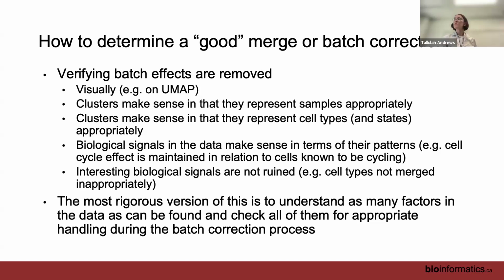You can also check whether your clusters make sense and whether they represent a single cell type, and each cell type is represented by a single cluster. Right? So if you have well-integrated data, you should get one cluster per cell type and one cell type per cluster.